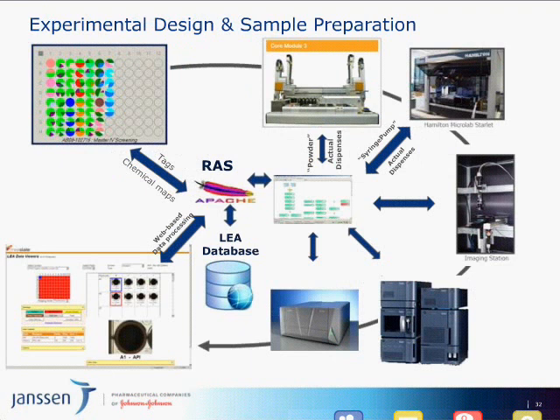So what we do before we start the experiment is the design of experiment. After that, we're going to dispense in our 96 well plates the API, the powder. We have the Hamilton liquid dispenser, where we can make the master mix blocks. So we start the experiment, and we're going to take images. We are also able to measure the concentration with our UPLC, and all this data is again imported and saved in the LEA database.